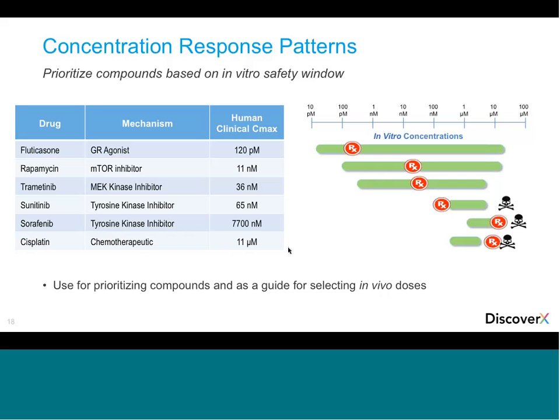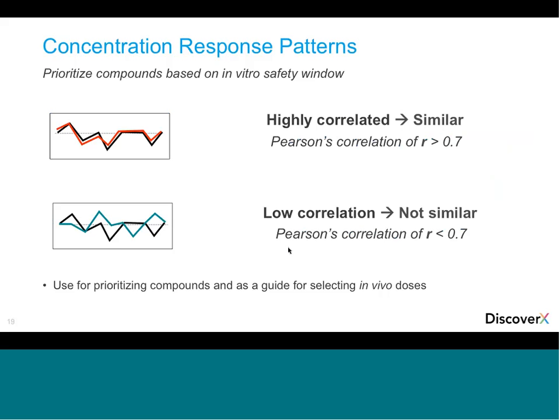And what I'm telling you here is that this platform allows you to pick this feature up in an in vitro setting, in a system where we can run hundreds and hundreds of compounds and don't have to run a lot of animal tests to be able to identify, select and triage compounds that will have a better safety window in vivo.